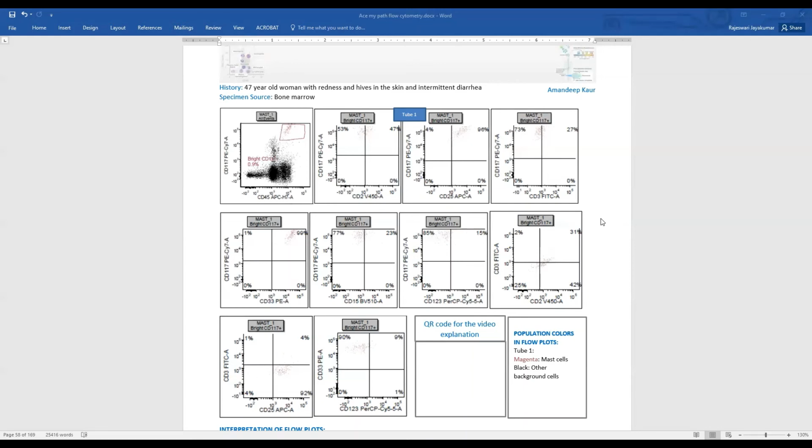As far as flow is concerned, you just try to see if there is an aberrant mast cell population. Both normal and aberrant mast cells can express CD117. CD2 and CD25 are the markers that you have to focus on here. CD25 is very easily positive on the aberrant mast cells. Almost 90% of systemic mastocytosis will express CD25, but CD2 is less commonly positive, although it is also one of the definitions for aberrancies in mast cells.